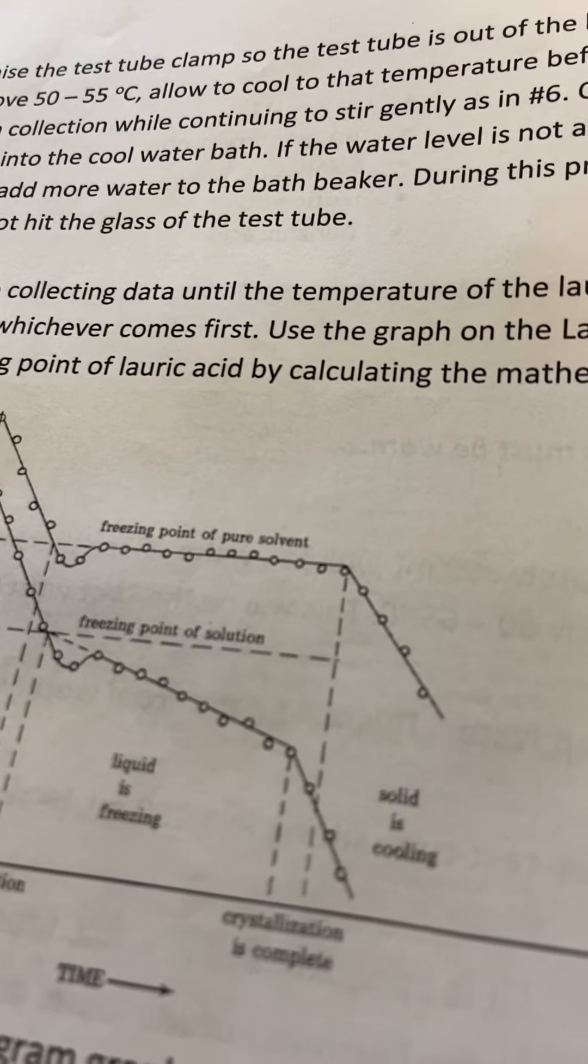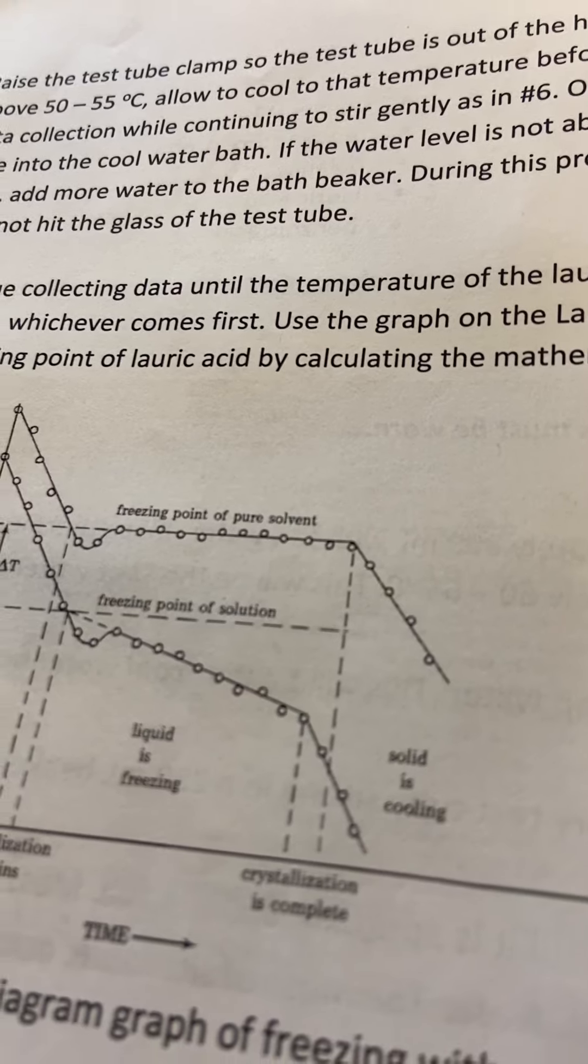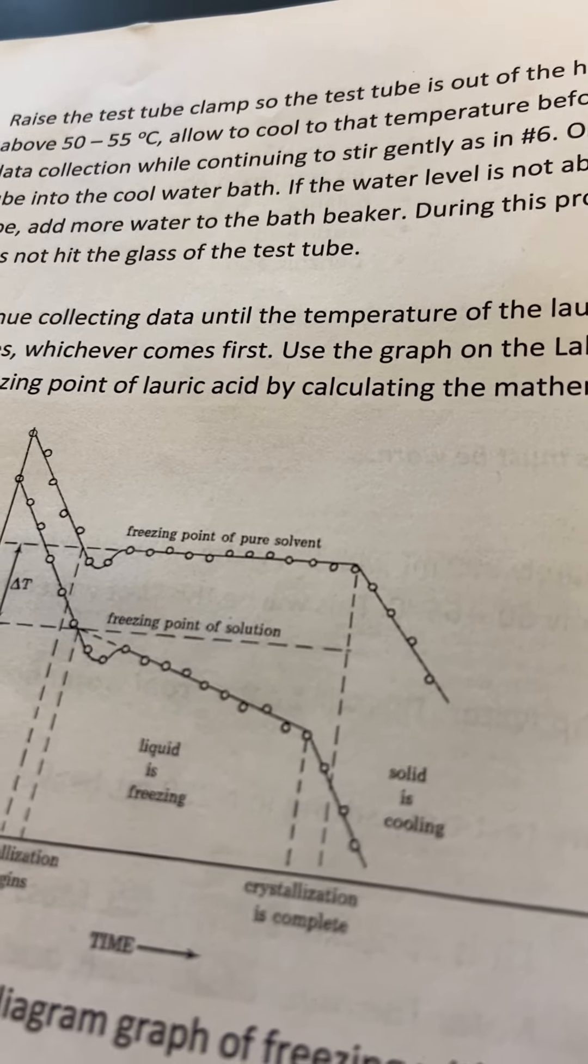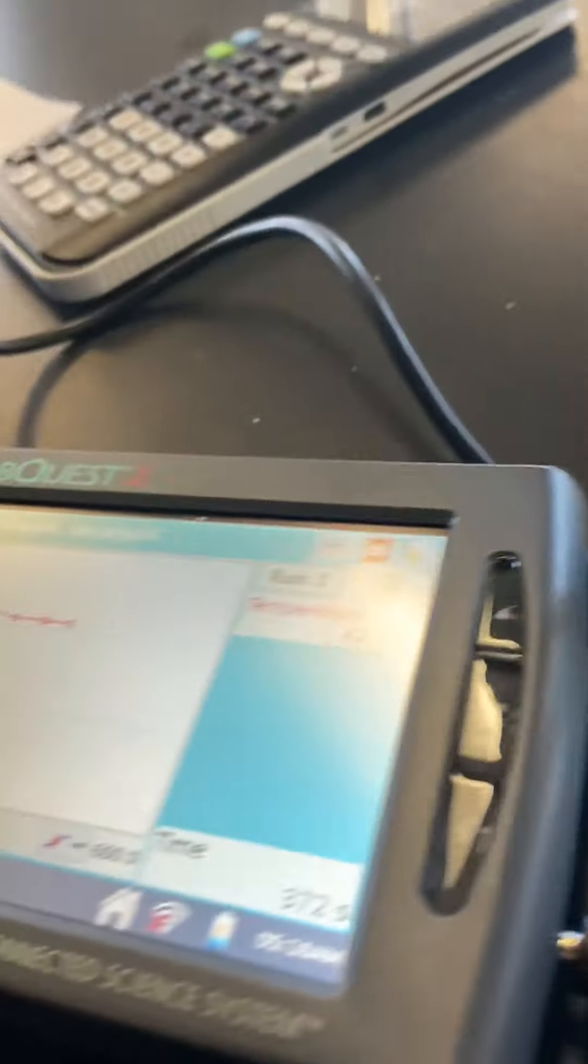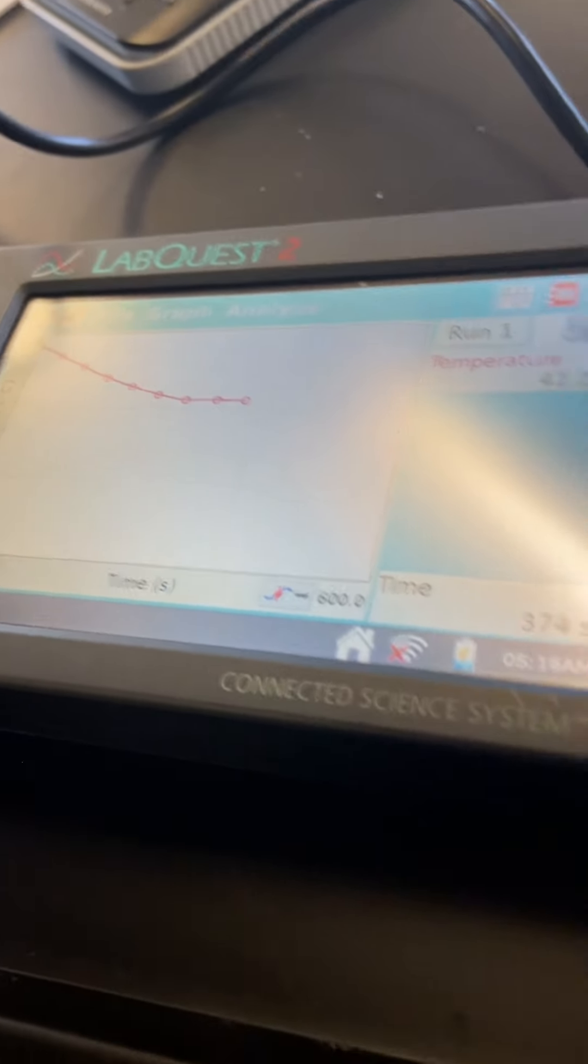Sometimes you take it below the freezing point and then you can see the temperature begin to drop as it equilibrates with the surrounding temperature. But usually we stop once it plateaus, which it appears that it has done.